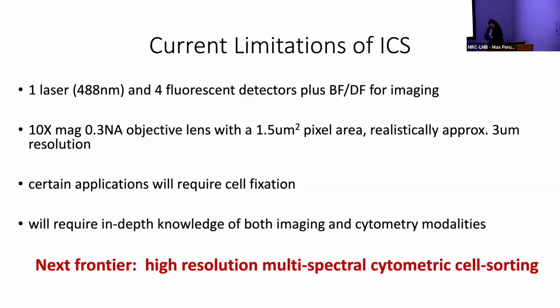We have currently a collaboration with James Manton in the Flow facility, and our postdoc, Bill Flanagan, is currently working on a system where he will expand Akash Kumar's development of a light sheet multispectral imaging microscope to couple that to a cell sorter.